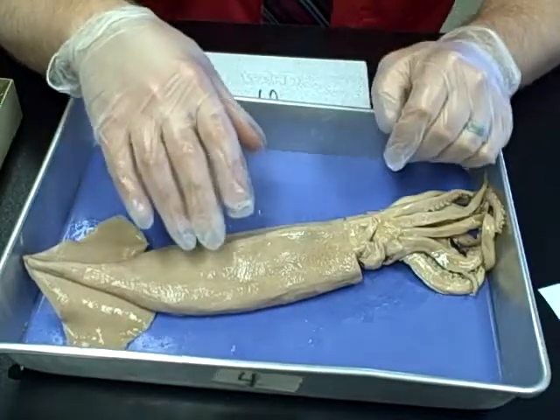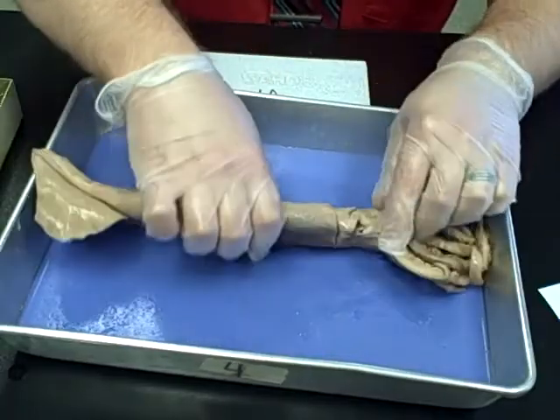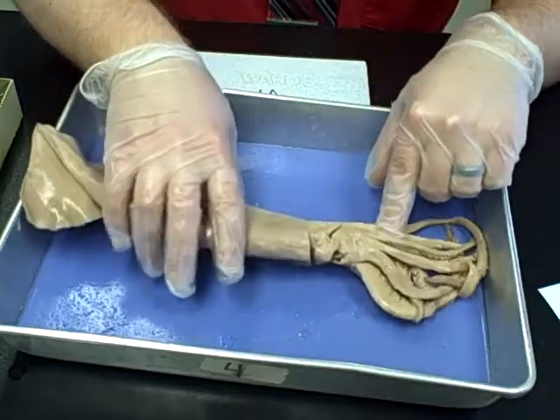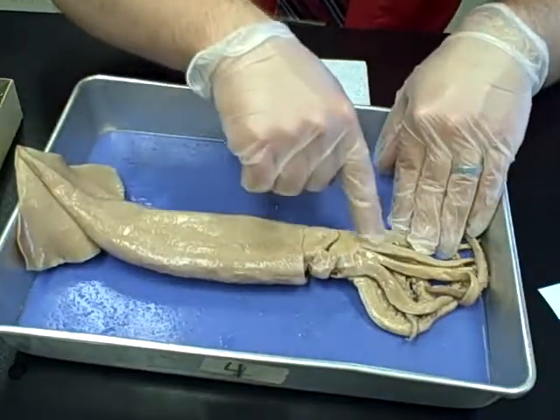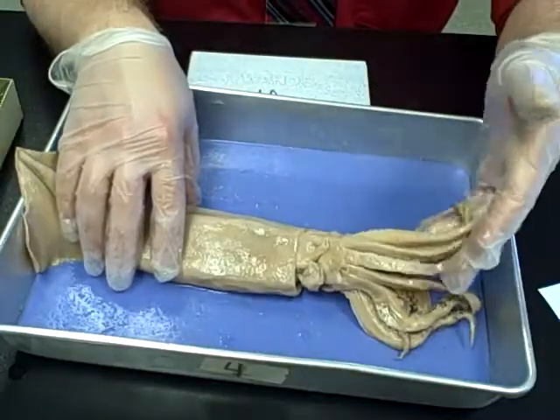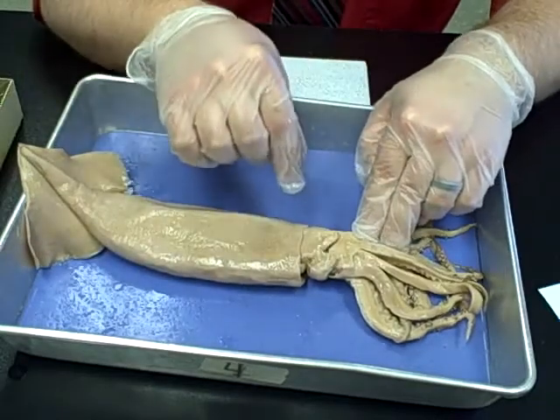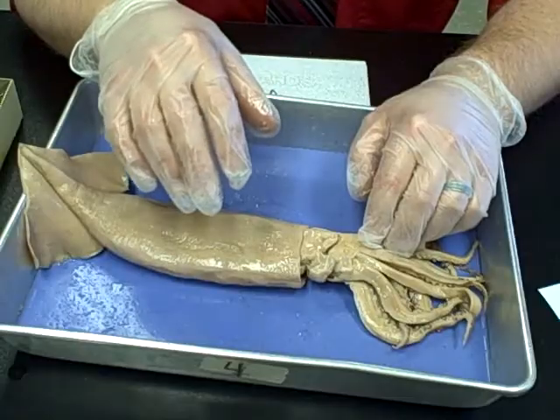Their name, cephalopods, means 'head-foot.' You can see you've got the head portion here. You'll actually do some steps with the eyes a little bit later on. With the name cephalopod, their feet and their head kind of originate from the same spot — their feet are the little tentacles and arms, and the head portion is at the top.